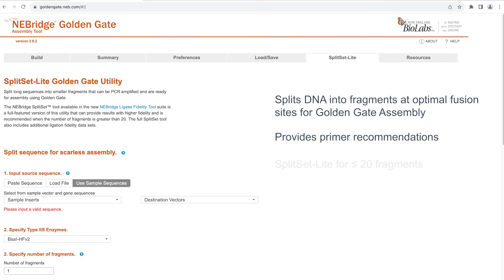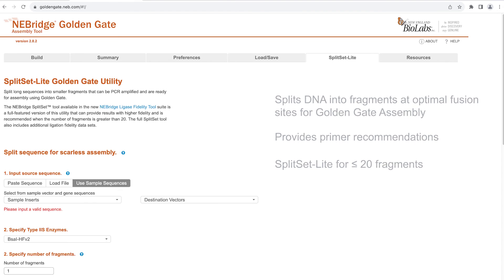Split Set Light is suitable for assemblies with 20 or fewer fragments. For more complex assemblies, the full Split Set feature is available with the NEBridge Ligase Fidelity Tools.